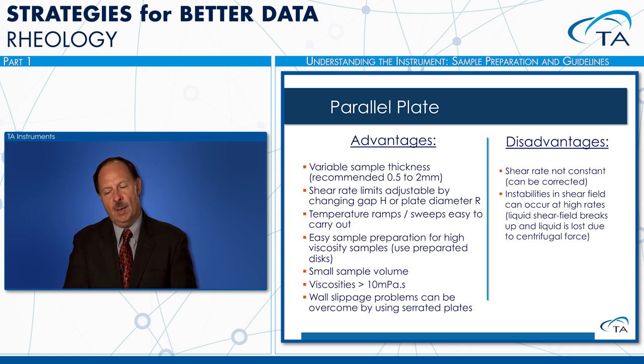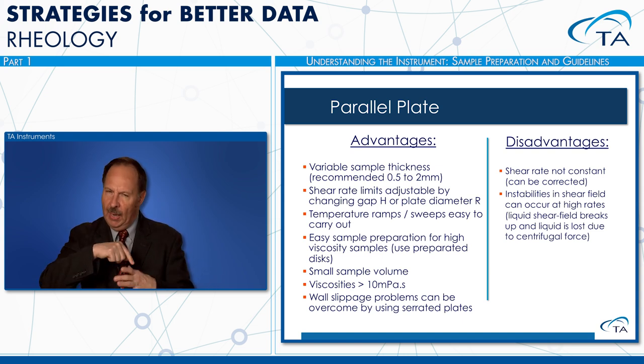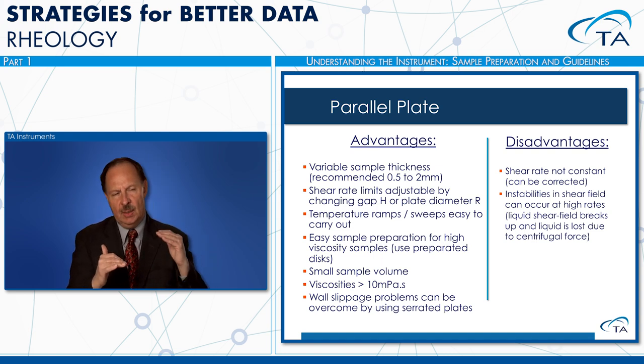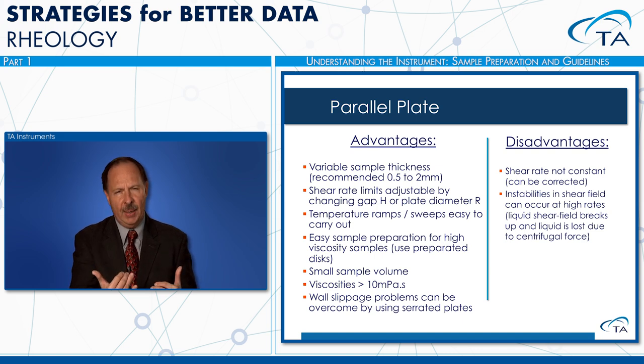But even with the concentric cylinder, where you might think, well, it's confined in there, after you go beyond a certain shear rate, you can start getting these vortices. And you might see that the shear stress will actually decrease as you go to higher shear rates. If that's happening, then you're in a region of flow instability and you're not getting good data.